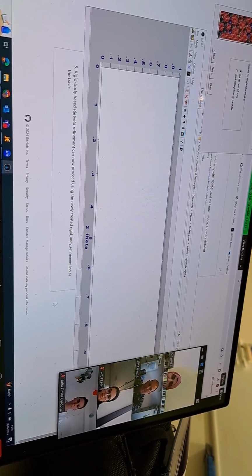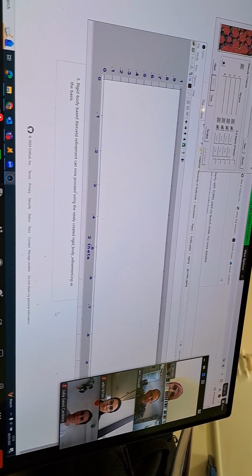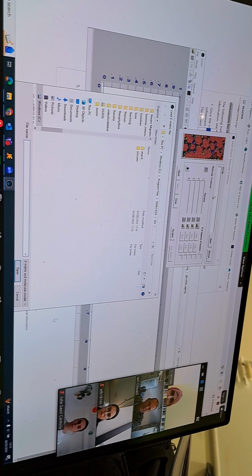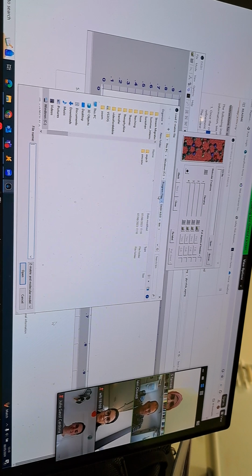So within DASH, we've got this new setup, simulated annealing runs, and we can click on to this. And here, I don't think you even need an SDI file then. Well, I guess you don't need to do it. Last week we did. For some reason, we don't this time.